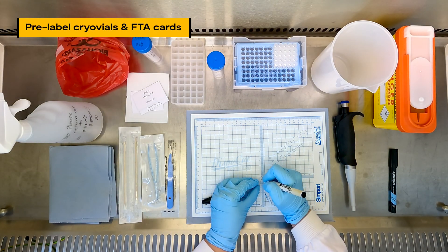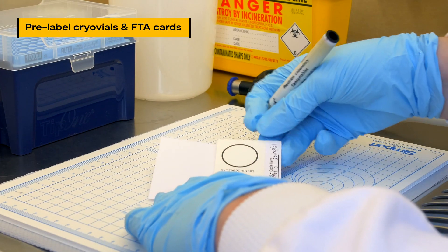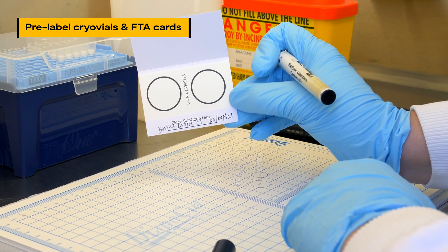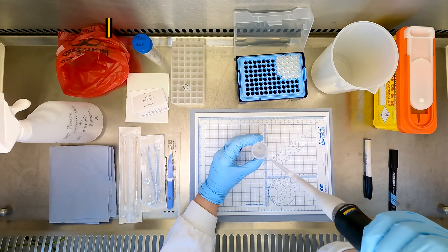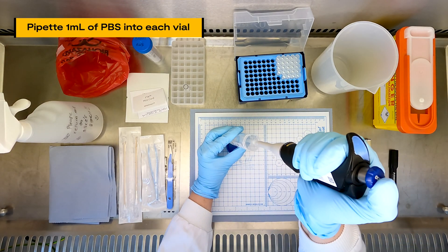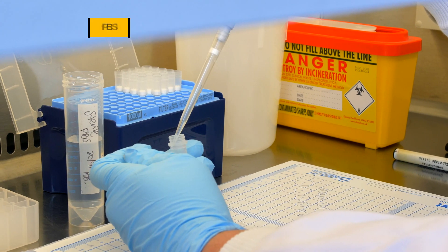First, pre-label sterile 2 milliliter cryo vials and blank FTA cards with matching identification numbers and the original date of brain sample collection from the dead animal. Then pipette 1 milliliter of sterile phosphate buffered saline, or PBS, into each pre-labeled vial.